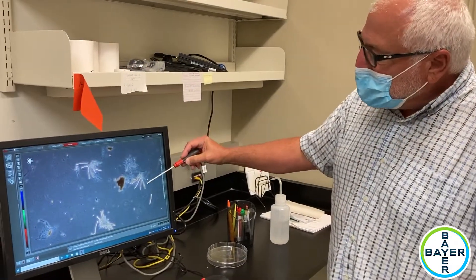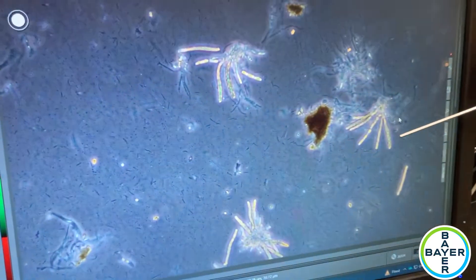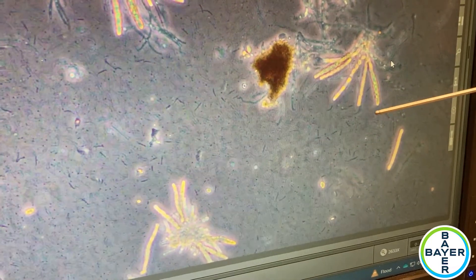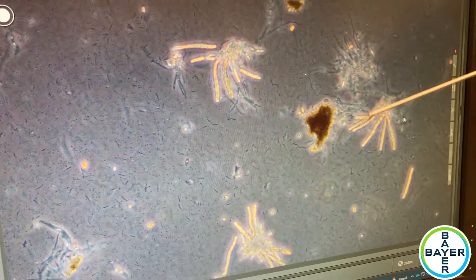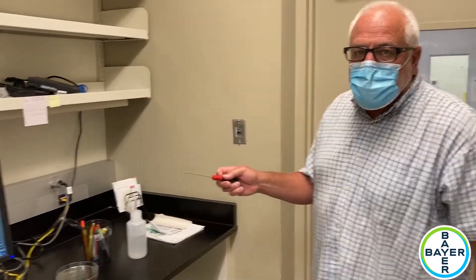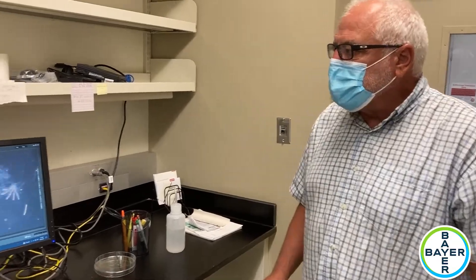What we see here are the asci, and inside each ascus are eight ascospores, which are the sexual spores for reproduction. These little thin ones are the conidia visible behind them. You can also see some of the stroma left over from when we crushed it and it burst open. These are very easy to identify as tar spot — the asci kind of give it away. It's a pretty easy diagnosis all around.